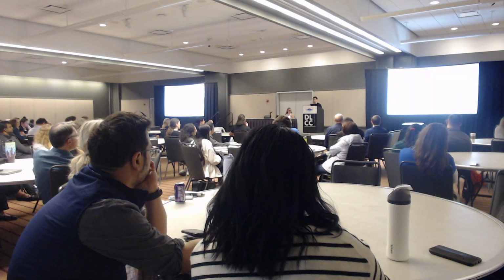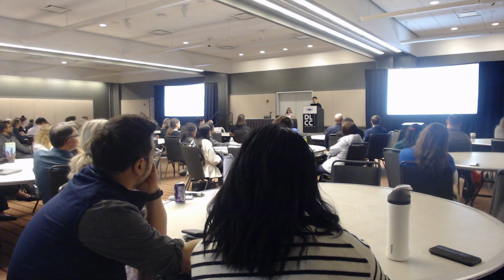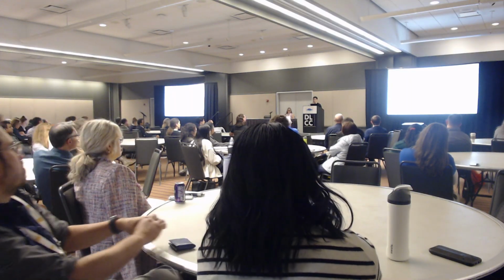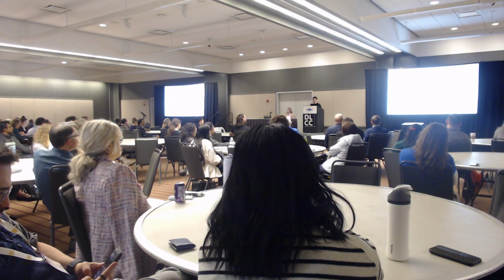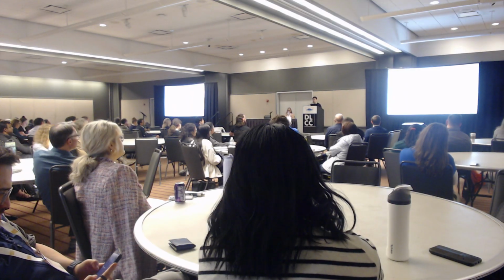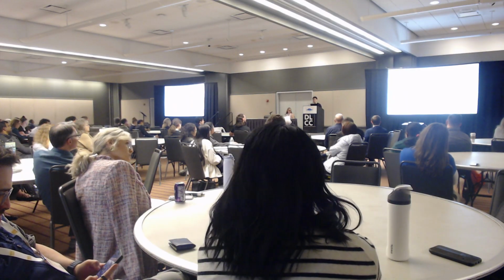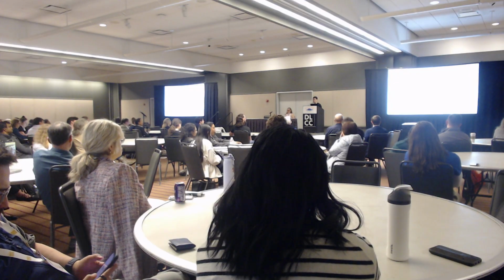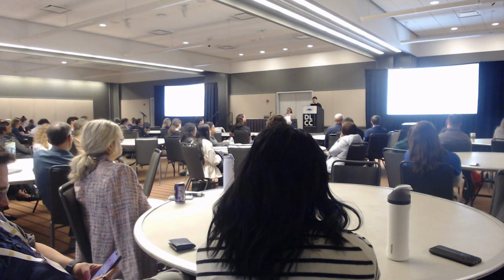So to address these challenges, spatial omics, or especially spatial transcriptomics, has emerged as a powerful tool to profile biomolecules without dissociating the tissue section. Generally speaking, there are two types of spatial omics technologies. One is the imaging-based methods. The other one is NGS-based methods.